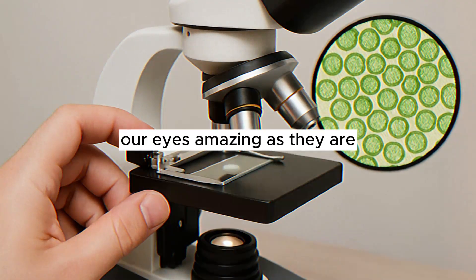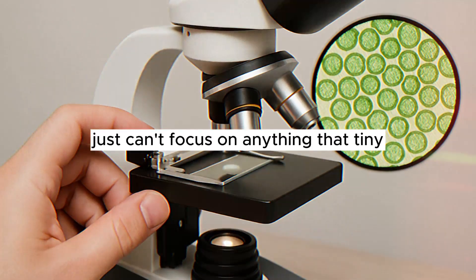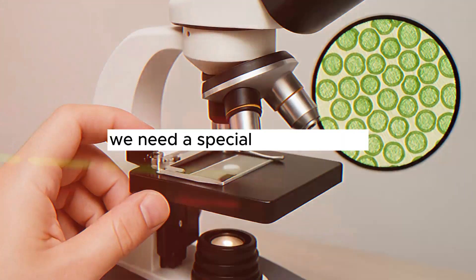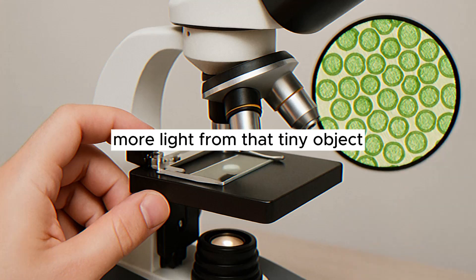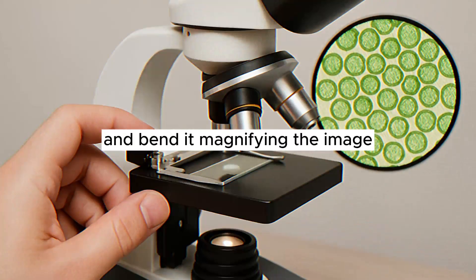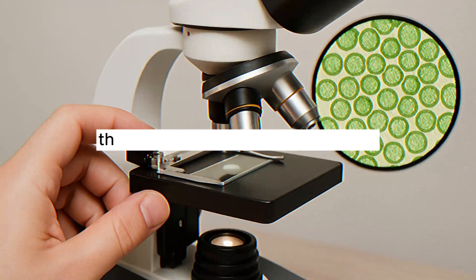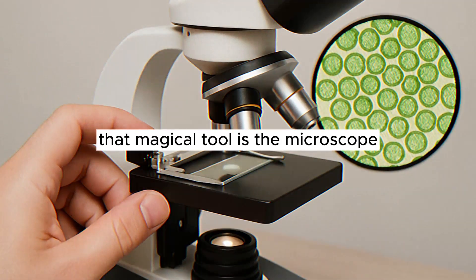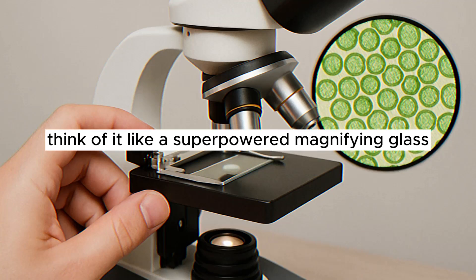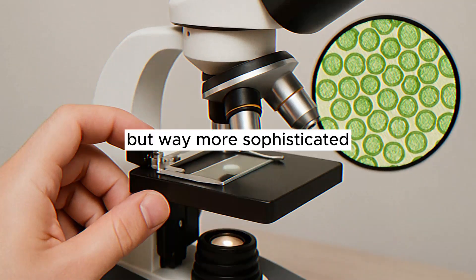Our eyes, amazing as they are, just can't focus on anything that tiny. We need a special tool to gather more light from that tiny object and bend it, magnifying the image so our eyes can finally perceive it. That magical tool is the microscope. Think of it like a super-powered magnifying glass, but way more sophisticated.